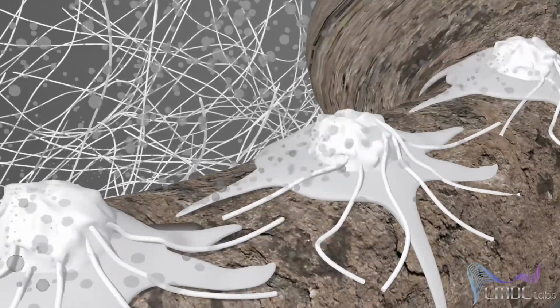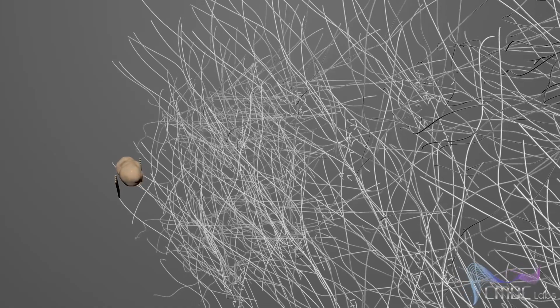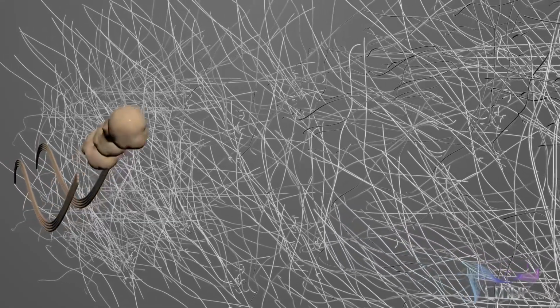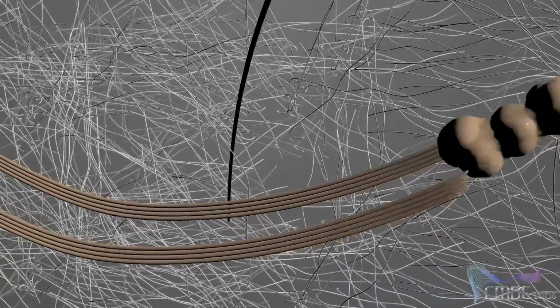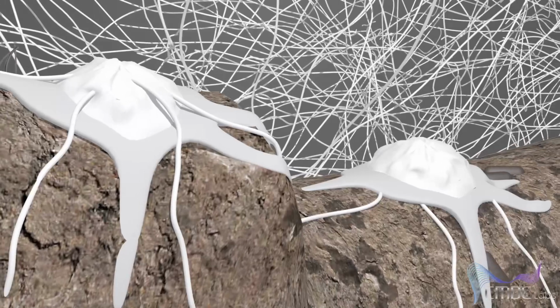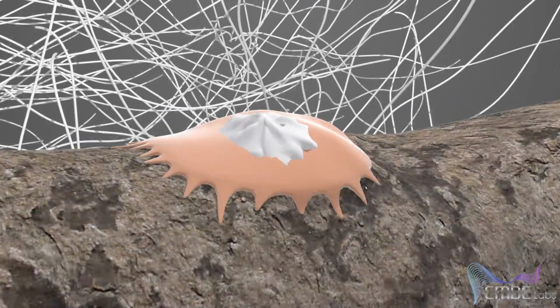Once at the implant material surface, macrophages are examined for their phenotypic differentiation, or M1, M2 behavior, and activation function, or release of inflammatory markers and proteases, in addition to their endogenous inhibitors responsible for preserving matrix proteins and proteoglycans of the wound. Messenger substances such as VEGF, PDGF, and FGF can be measured in real time using the CT chamber to monitor fibroblast stimulation and the process of angiogenesis that begin the proliferative phase.